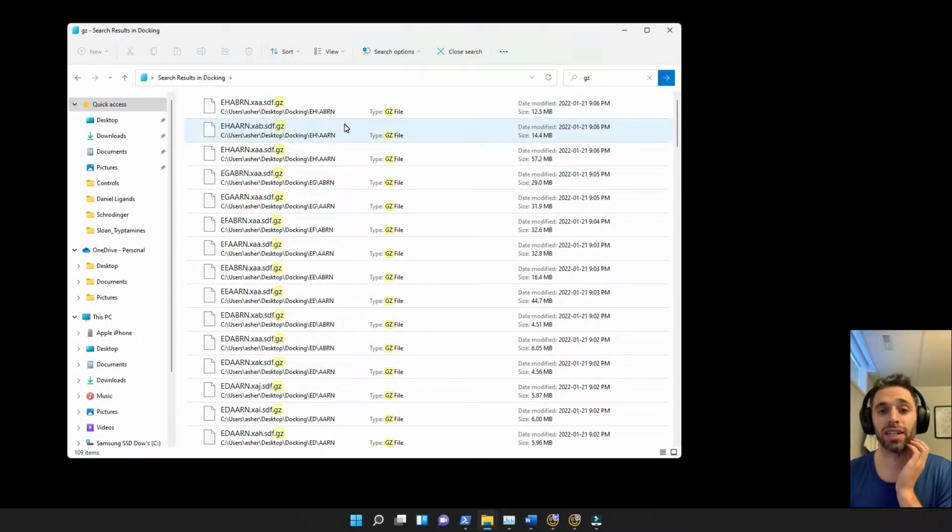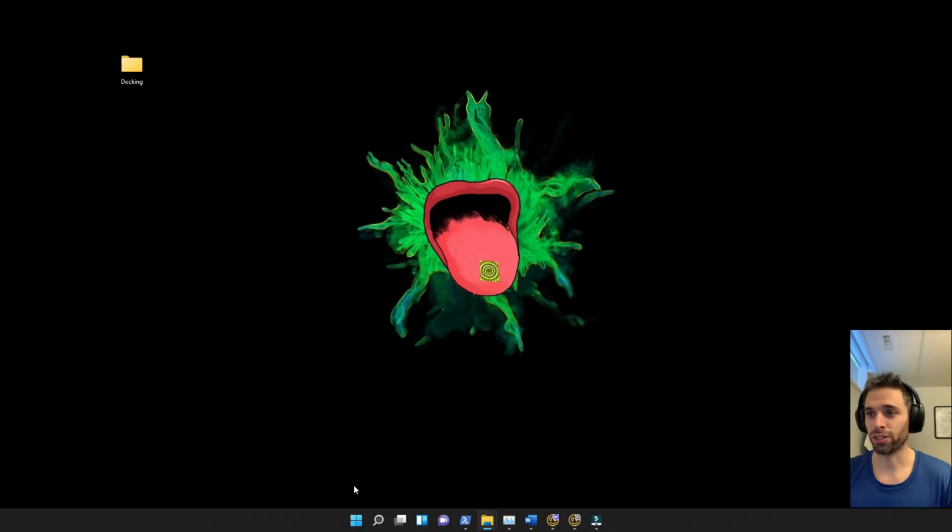Me personally, with my computer setup, I've realized that I can screen in one Maestro workspace about 500,000 ligands before my computer has issues. With my license, I can do 5 different files. That would mean that I can screen 2.5 million compounds at a time, which is basically all of the compounds. So here's what I'm going to do. I'm going to open up a Maestro workspace.